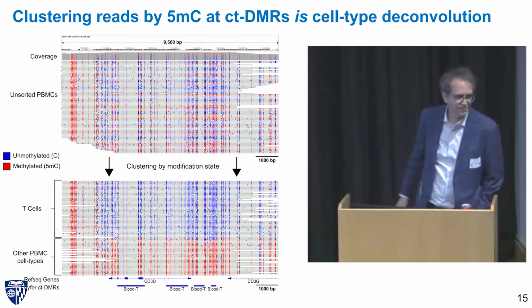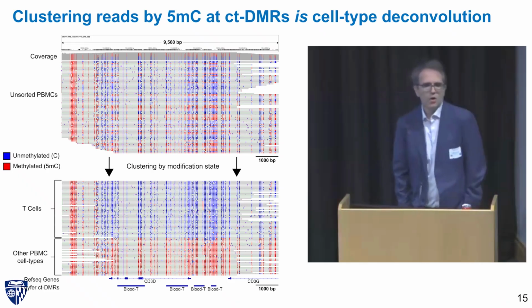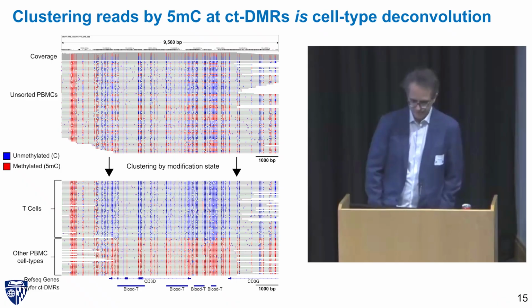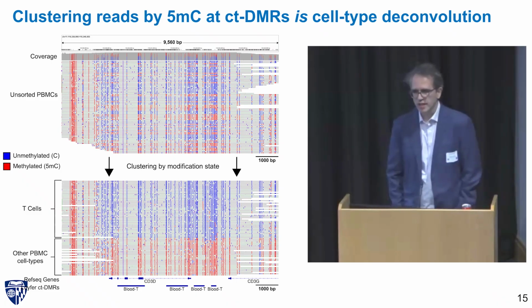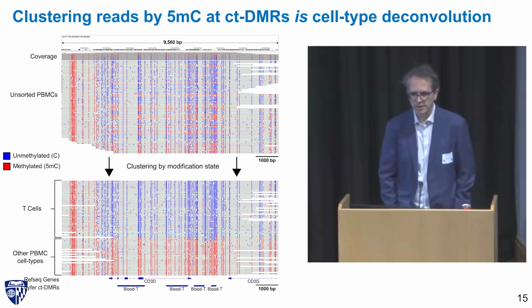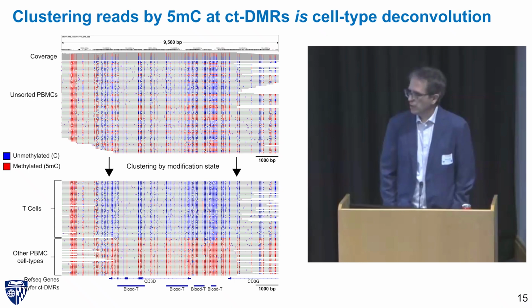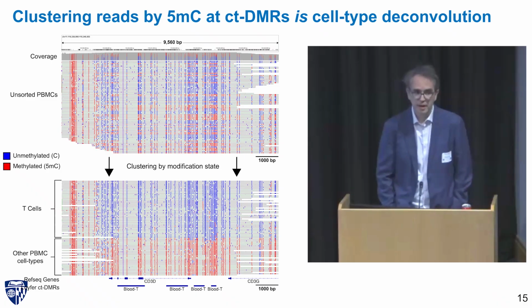Yeah, some loci are pretty much always methylated, but some have some variation. Is that just that location being hard to see if it's methylated or not? Yeah, it's biologically variable. So to restate your question, how well can we call methylation, and is there biological variability in methylation? We are filtering to only accept really confident calls here. So if we're not sure about it, we would drop it.